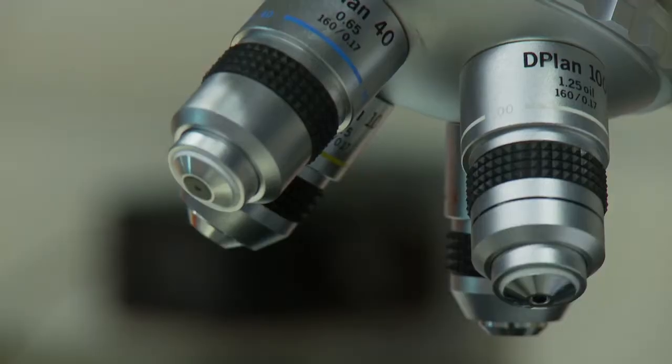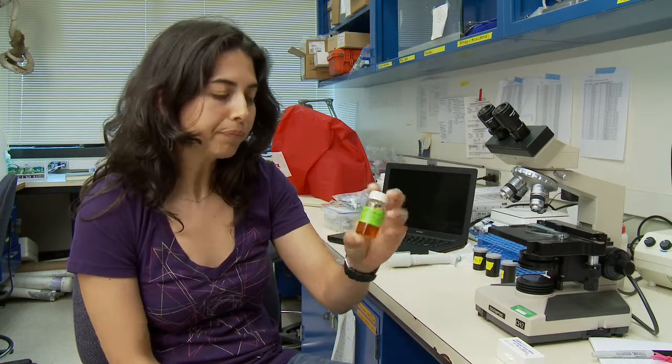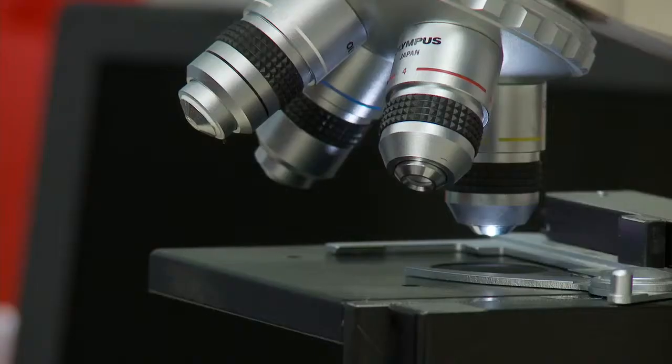The next and final step here is to look at our algae samples in a lot more detail. We've already gotten an idea of the total biomass, so how much of it's there, but we also want to know who's there. In order to do that, we have to look at these samples under the microscope. Here we've got a sample of algae that we have preserved, and we need to take out a bit of the sample and put it into the special slide, and then we just look at it under the scope.